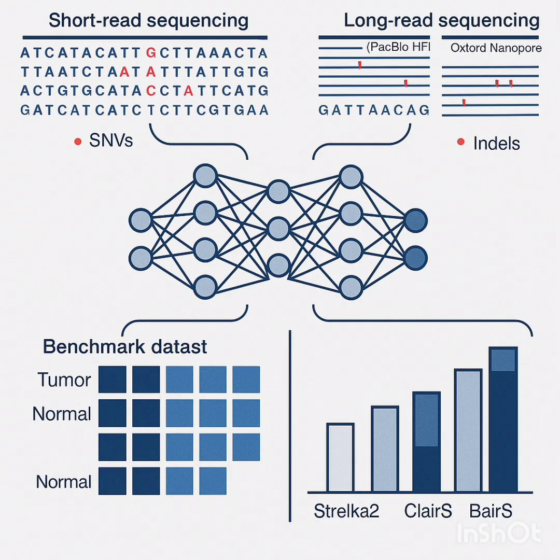Okay, and this is where, I guess, the long-read technologies come in. PacBio HiFi, Oxford Nanopore, ONT. This is where things get really exciting. These technologies give you reads that are just massively longer. We're talking 2 or 3 orders of magnitude longer, tens, even hundreds of thousands of bases. Huge difference. And critically, the accuracy, especially for the newer long reads like HiFi and duplex ONT, is now really good, over 99.9%, so comparable to short reads on a base level.